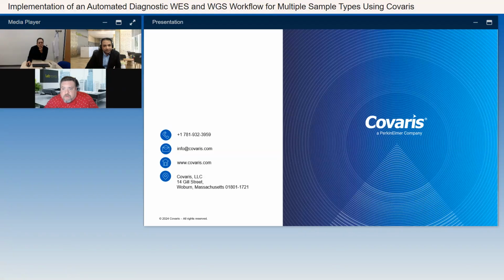In your automated WES workflow, you achieved a first-time success rate of 96.4%, followed by a second preparation step for the initial failures, bringing the overall success rate to more than 98%. Could you elaborate on the adjustments or strategies implemented during the second preparation to minimize the failure rate?